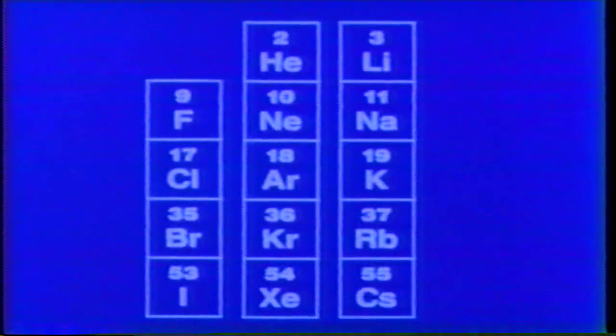Finally, cesium melts quickly, then reacts, also producing a solid product. As with the family of noble gases and the family of reactive nonmetals, these metallic elements also show marked similarities. Perhaps they are also a chemical family.